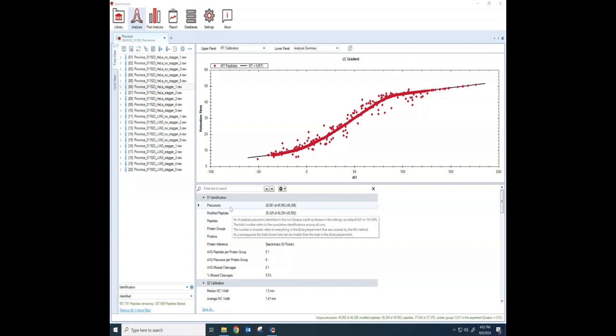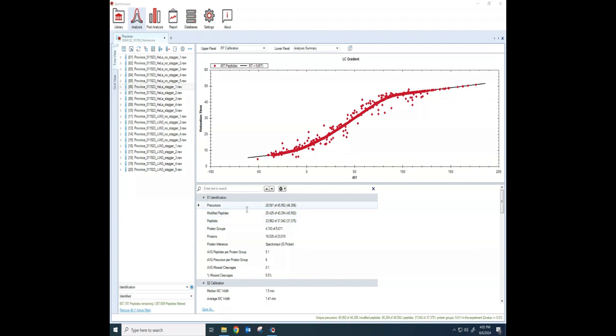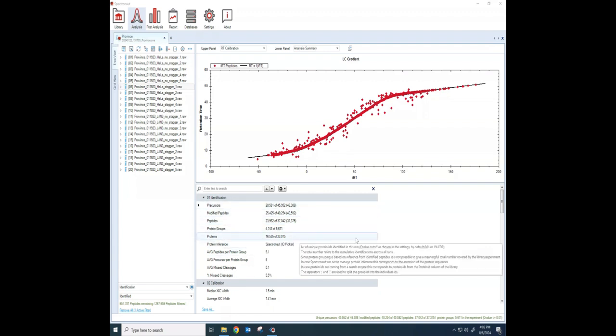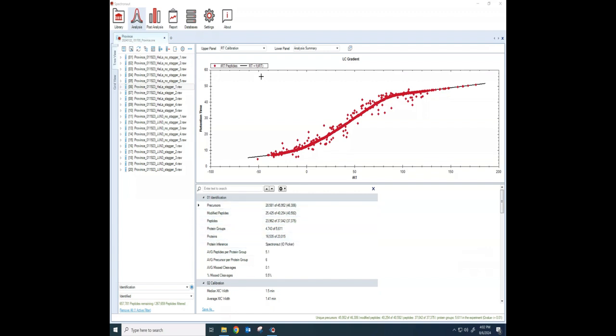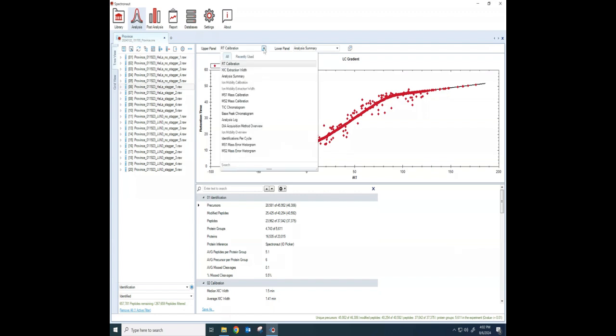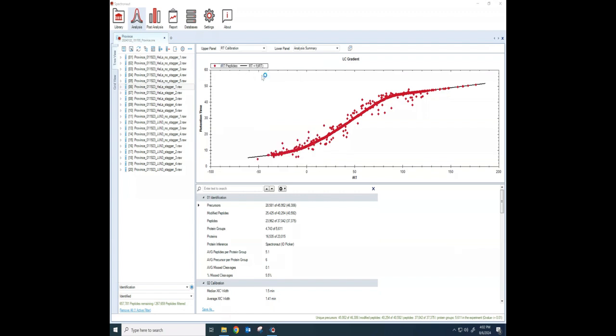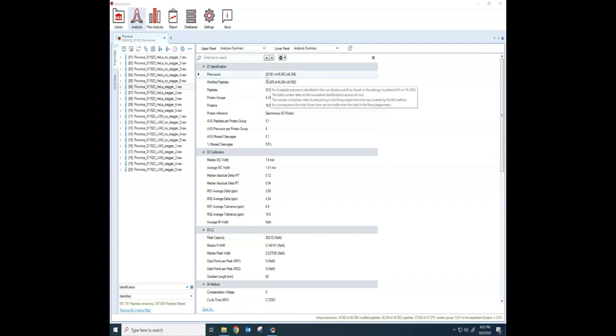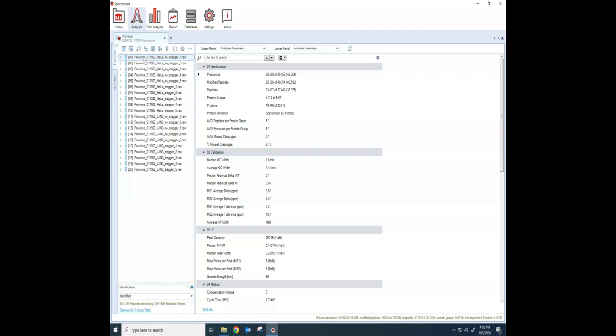We're going to start here. This window down below, which is called the Analysis Summary, if I do this with both the upper and lower window, it will just expand that. The Analysis Summary will tell me the number of precursors that I have for any particular sample that I have selected here.